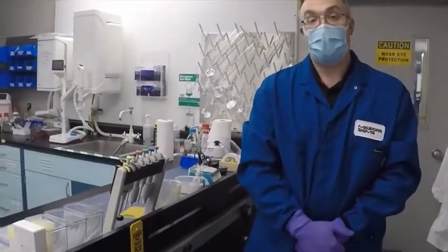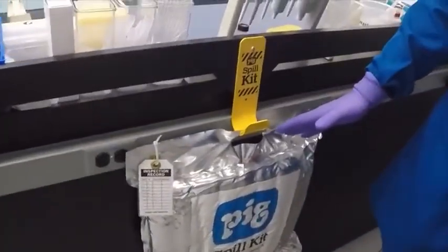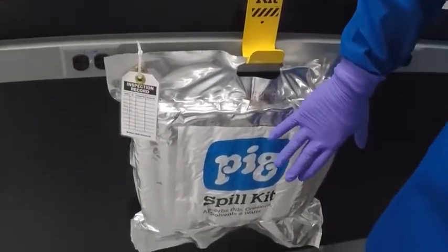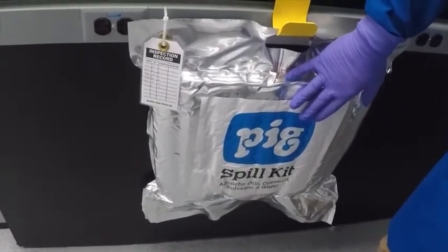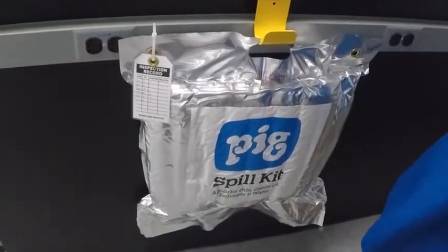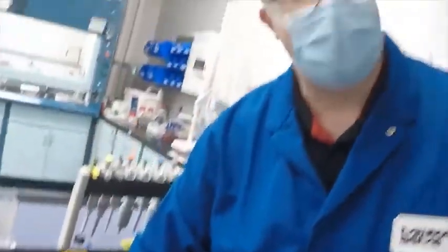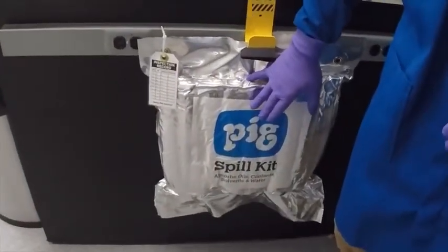Another safety device you should have in your laboratory is a spill kit. Spill kits are used in case you have a small spill that needs to be cleaned up. They should be placed where they're very conspicuous — on a hook, for example — so you can tell if one is missing. All spill kits need to be inspected on a monthly basis per OSHA. This particular kit is sealed: if the seal is broken, you know something has been taken out. If you have one that is not sealed, all contents need to be inventoried on a monthly basis per the OSHA regulation.